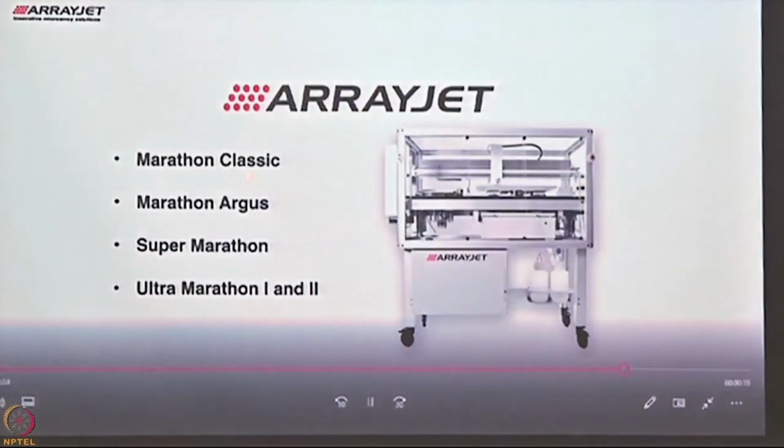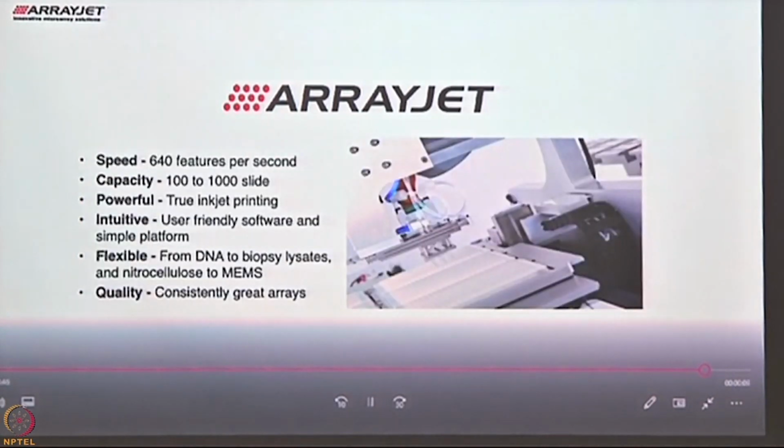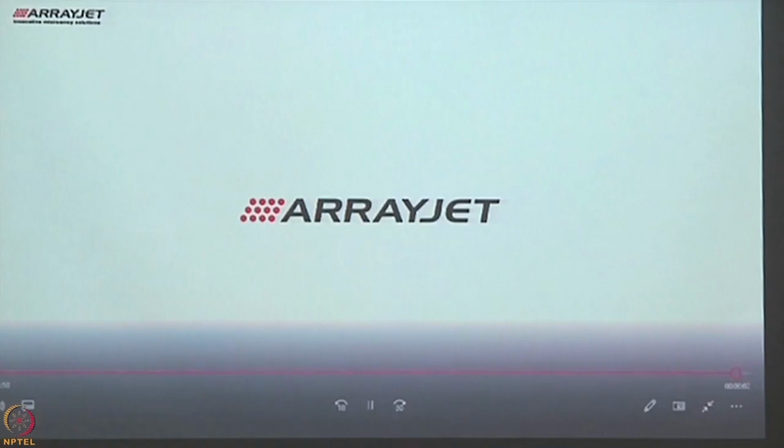Once it's finished doing it, it obviously has a standby mode where it is able to wash itself. So many people must be concerned, how do you do the contamination? Is it contaminated? If you're picking up another sample, does it? No, it has its own individual wash cycles. So it does washing automated. So, whole thing is automated. So, it not only does the washing, after every time it picks up a new set of 12, it washes internally, and once the washing is complete, it makes sure that the samples are getting back and your new set of samples is going back in.